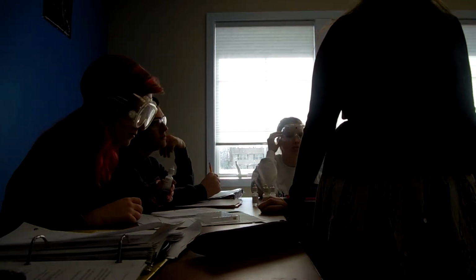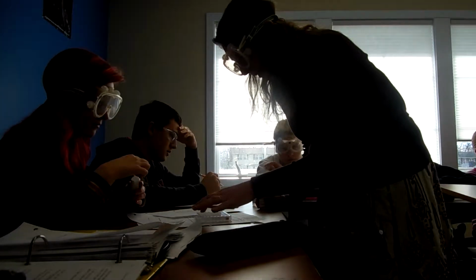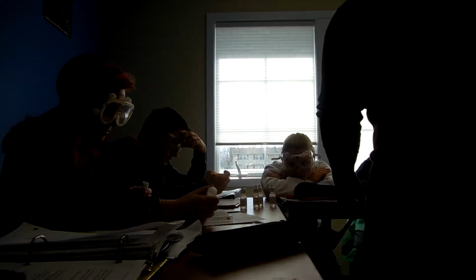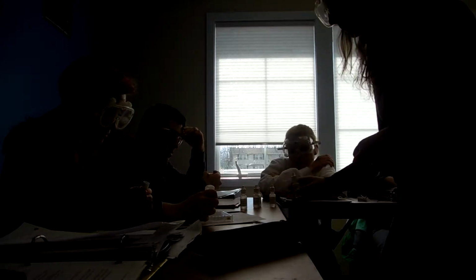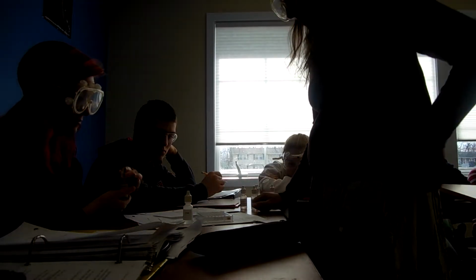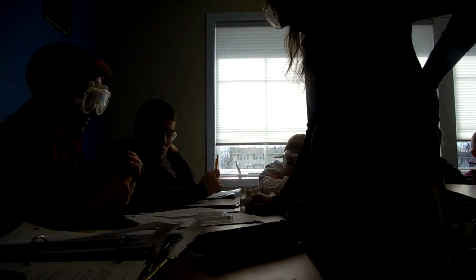So, copper nitrate, sodium oxalate. So pick an empty well far away from the others. Oh, we lost the bottom. Okay. So she mixed copper nitrate and sodium oxalate.